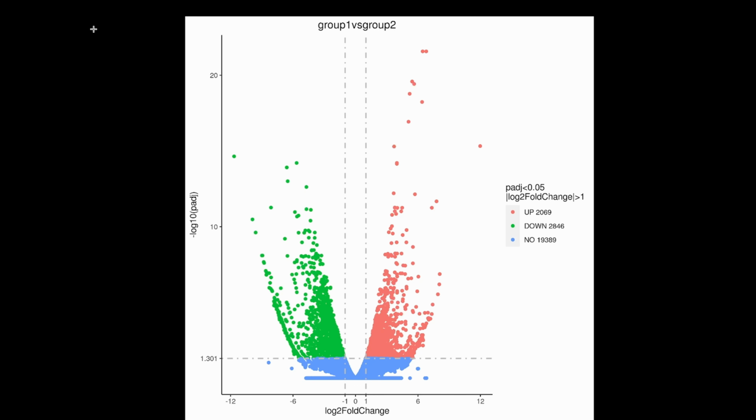So you have done your RNA sequencing, performed your RNA sequencing data analysis, and have identified genes that are differentially expressed. And in your analysis, you have realized that there are genes that are upregulated and there are genes that are also downregulated. What next after this? What do you do with your RNA sequencing data? Now, this is where downstream data analysis or processing comes in.